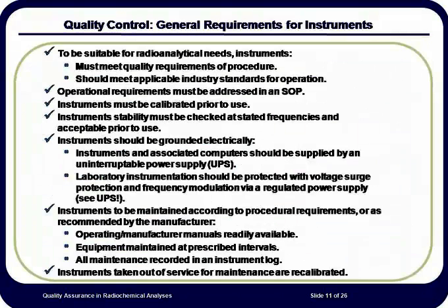Instruments used for radiochemical measurements must meet quality requirements of the method being used and should meet applicable industry standards for its operation. Operational requirements for each instrument must be addressed in a standard operating procedure, or SOP.